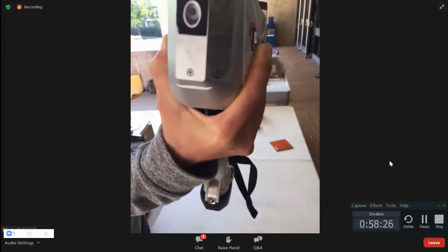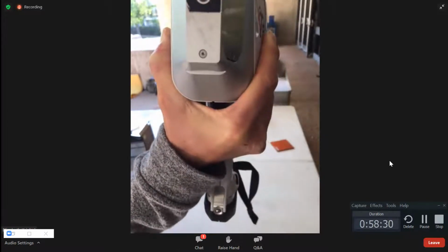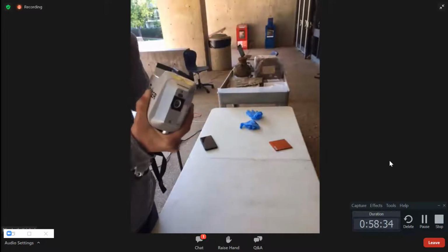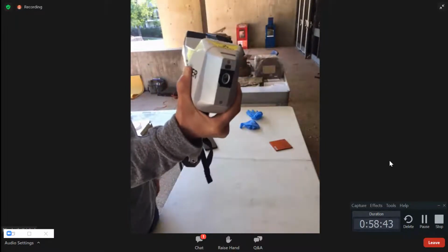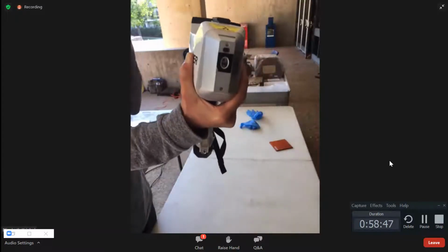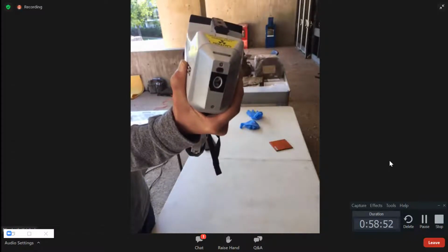All the objects we've measured here don't really pose much of a risk, but that's not always going to be the case. If you get anything on the inside of the instrument, you either have to live with it forever or spend thousands of dollars to replace the components. As I was telling these folks earlier, I used to work for the company that manufactured this. I was actually on the design team for this particular instrument. So any hate mail you have regarding its design, you can send to me. Anyway.